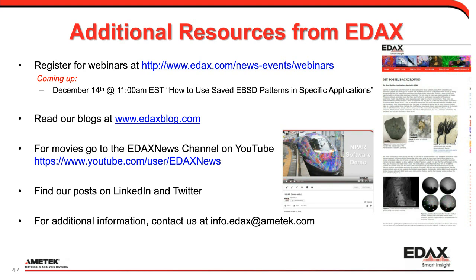Let me go ahead and look and see what we have here for questions. So I have an old question here talking about data management. The question is, for data management, can you save and export your pattern data as zip folders the same way you can save and export your EDS data in a compressed format? The answer to that is yes.